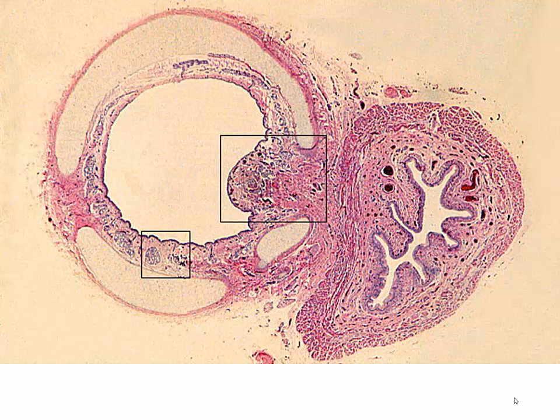As we begin, we're looking at a cross-section through essentially the throat, where we can see a cross-section of the esophagus that's present on the right. And again, remember, our esophagus is going to show this highly folded mucosa, our submucosa. These are some blood vessels present. And then when we get into the adventitia, it's going to blend with the adventitia of the trachea.